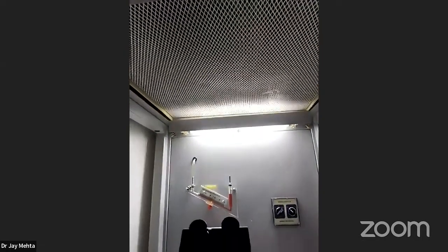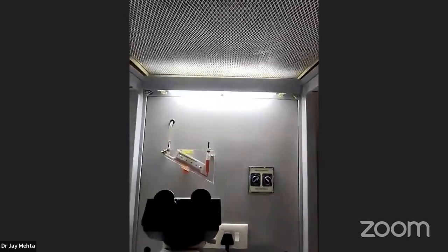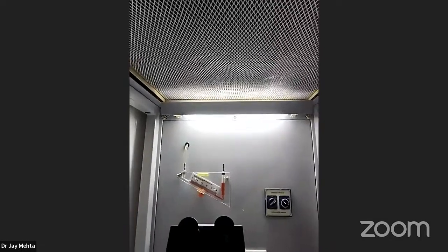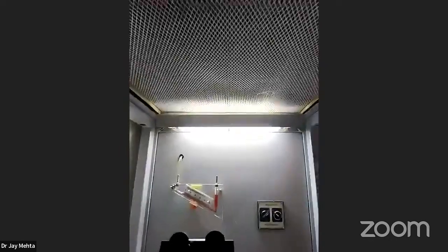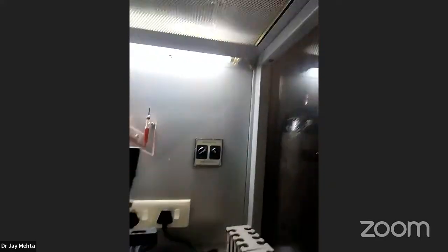So this laminar airflow is something which is very, very easy to create. You can even build it in your own home. It has something called a HEPA filter inside. HEPA basically stands for high efficiency particulate air. It is that type of filter which is present inside this. What the HEPA filter is going to do is collect all the particulate matter from outside air, and push clean air inside.